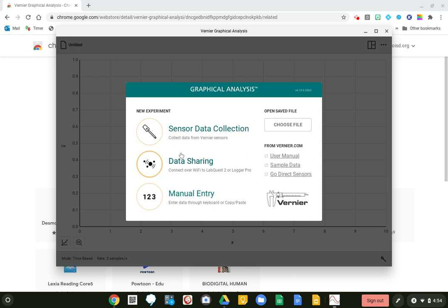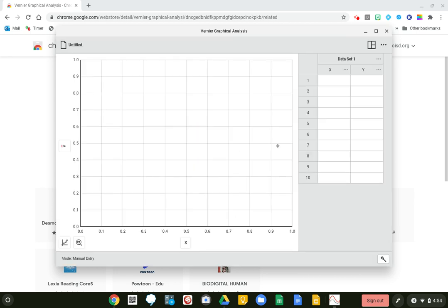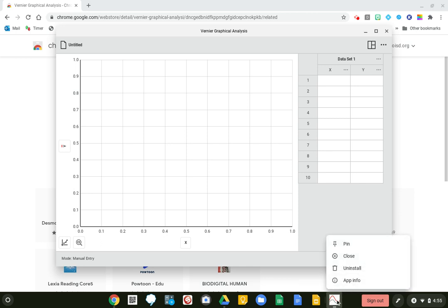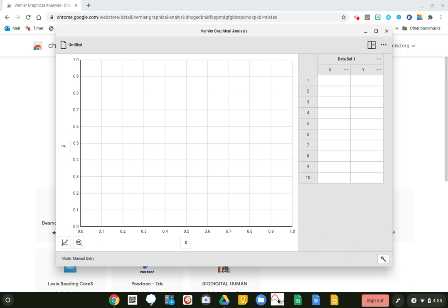Maybe if we ever get back to face-to-face we'll be able to do some sensor data collection, but for us we are going to use manual entry. You can see you've got a graph and a table, and it looks pretty straightforward. Because I'm in Google, I'm going to right-click, pin it, and then put it where I want it with my tools. So that's how you download the Graphical Analysis 4.